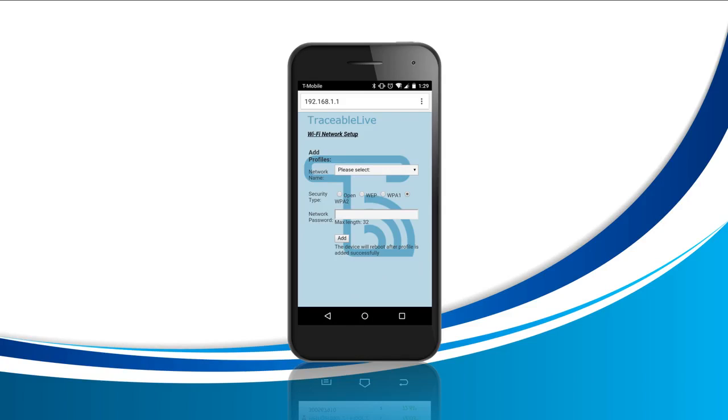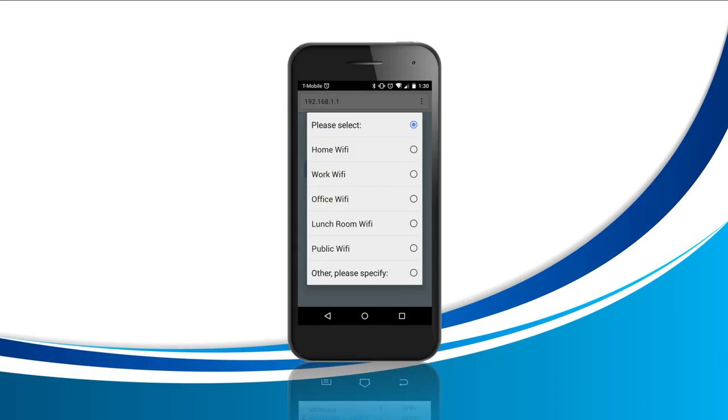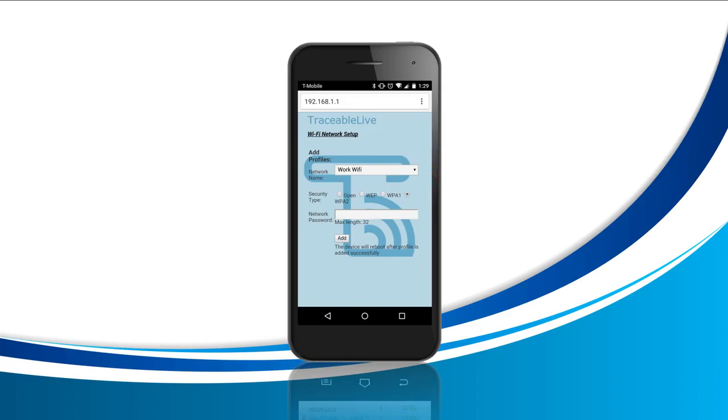On this screen, we'll start with tapping on Please Select to the right of network name. On this list, you'll need to find the network that you'd like your TraceableLIVE device to stay connected to. Once you find the network, tap on it to select it. Next, go to Network Password and on the empty box to the right, type in your network password. Don't click Add just yet once you're done. Let's move on to Step 7 first.